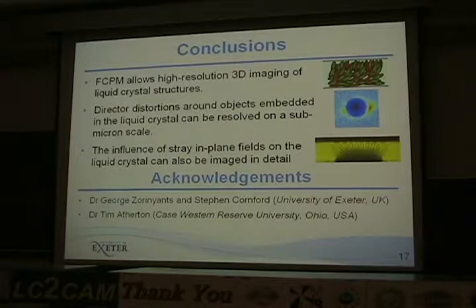It is interesting. It's parallel aligned at the surface. So it's rubbed polyimide, so it's medium anchoring, but it does look really neat under the microscope. You actually do see these stripes. It is physically there: where it's black, you've actually tilted the director through 90 degrees.